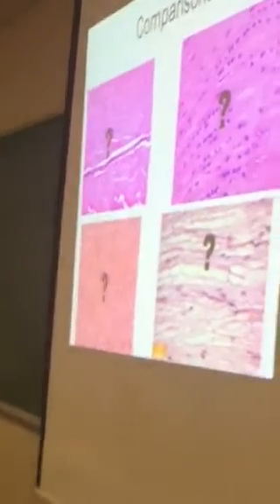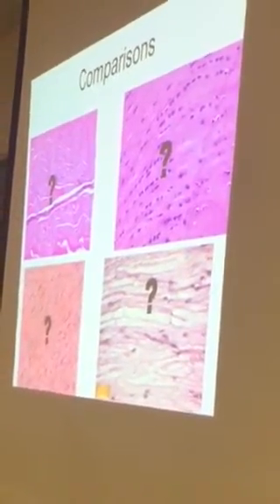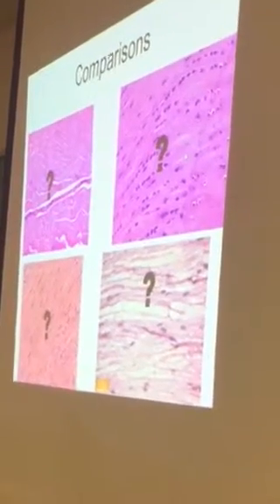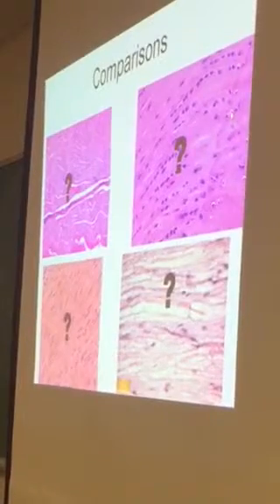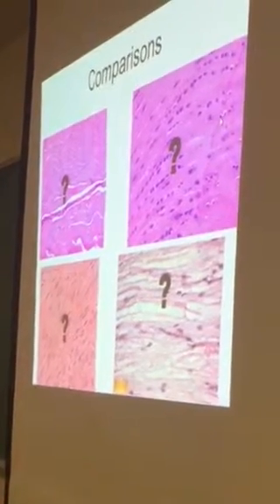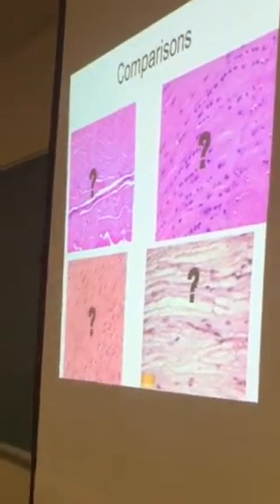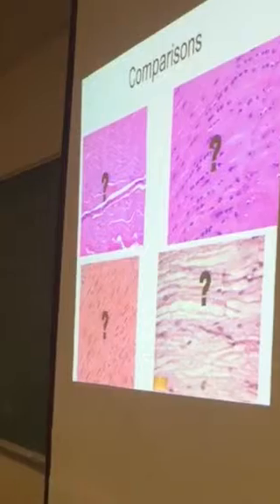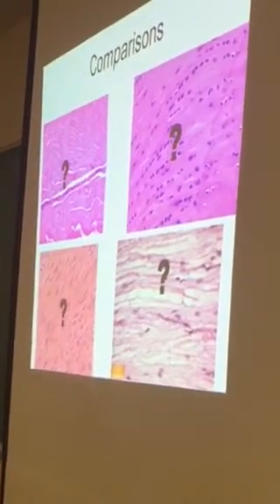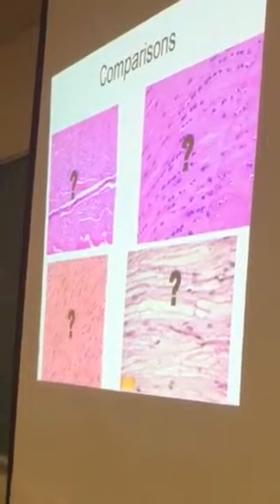They're very small, which means they are not cartilage and they are not muscle. So what's this? Fibrocartilage. Look at the cells. They have space around them. That's a lacuna, which means you're dealing with a chondrocyte. So the one cartilage, which is very, very regular because it must support a lot of structures, is your fibrocartilage.